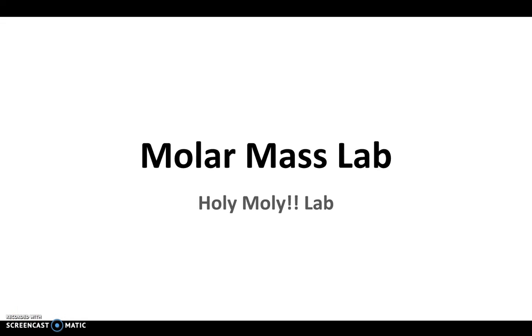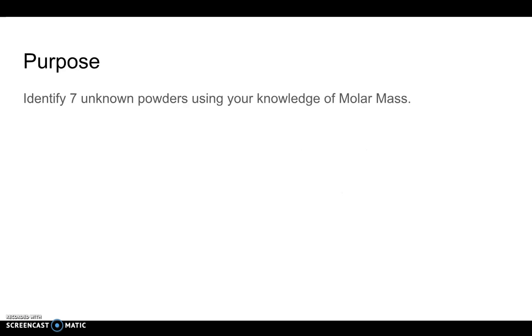All right, you guys, today you'll be working on the Molar Mass Lab, aka Holy Moly Lab, aka the Mysterious White Substance Lab. What you'll be doing is really reinforcing your skills around calculating molar mass. So here's the setup. You are going to identify 7 unknown powders using your knowledge of molar mass. You are not going to open the plastic bags that the powders are in, so just put that thought right out of your head.